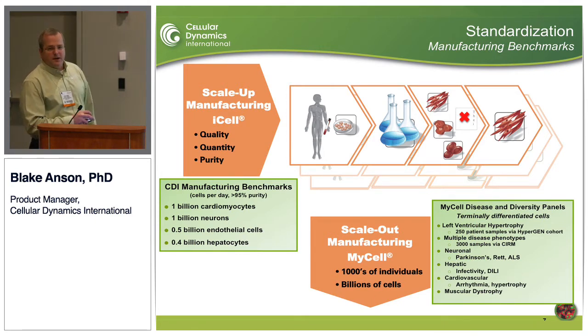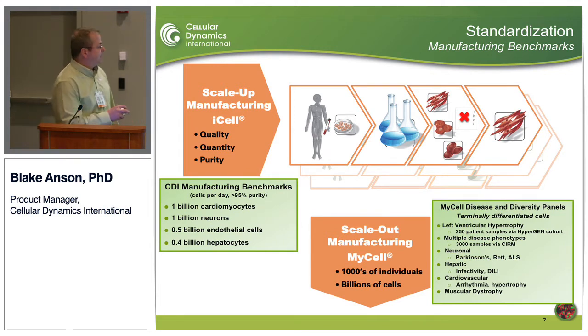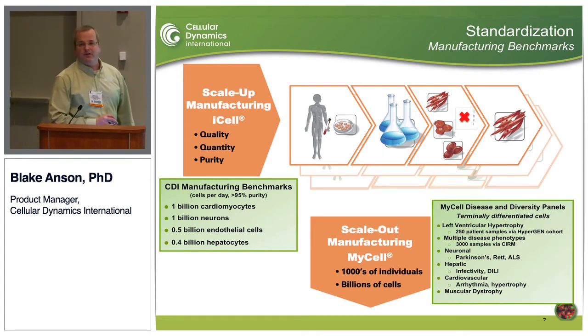We've also got other endeavors going on, where we've got an award from CIRM, California Institute of Regenerative Medicine. We're going to be reprogramming iPSCs from 3,000 donors, and doing three clones from each donor, so 9,000 total samples. They've got smaller endeavors looking at neuronal, hepatic, and other cardiovascular endpoints. So we're really covering the wide gamut.